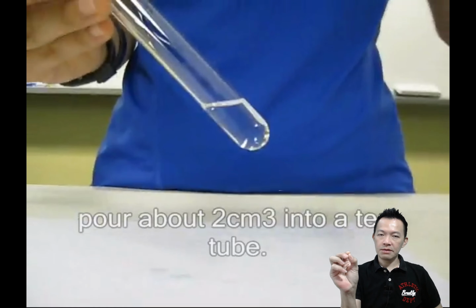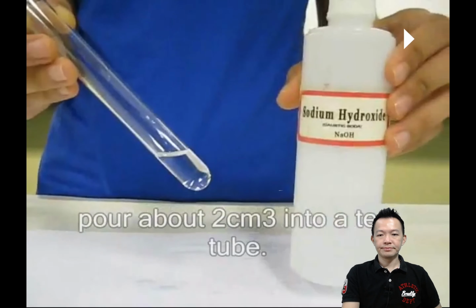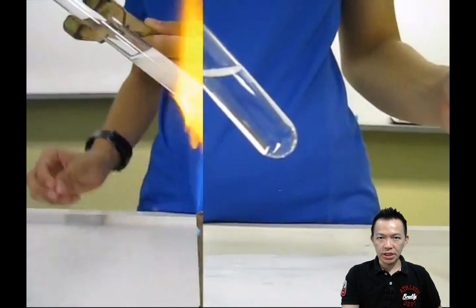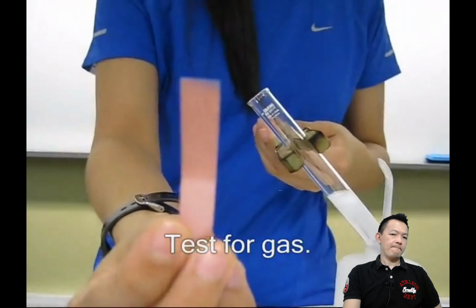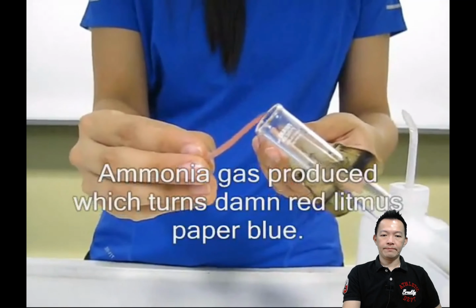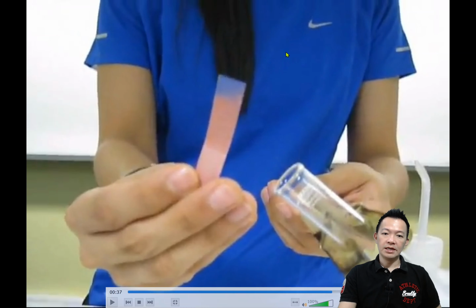Okay, ammonium salts. It may be ammonium nitrate, ammonium sulfate, ammonium chloride. Never mind which, as long as there is ammonium inside, it is correct. No precipitate will be formed. Okay, if you want to confirm more, you produce ammonia when the salt solution is heated. And finally, the ammonia makes the moist litmus paper become blue, or you can test with concentrated hydrochloric acid. So this is the first test only.